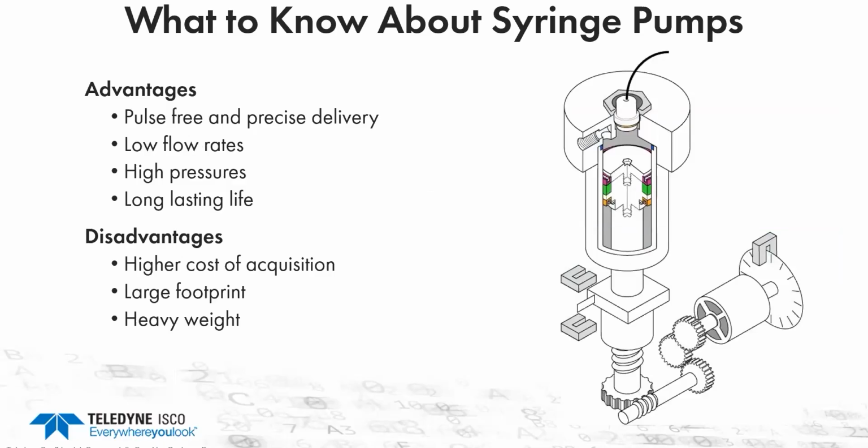The unique design of a syringe pump will allow you to deliver your pumping solution without any pulsation at high pressure and wide flow rate ranges. But keep in mind, this pump comes with a higher price tag. It is much heavier and has a larger footprint. So if pulsation is not an issue and you plan to move this pump from place to place, maybe you should consider other options.